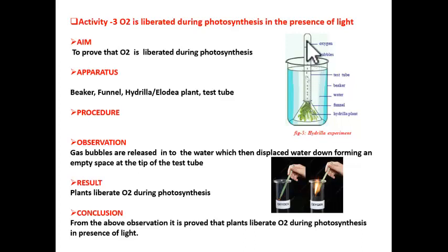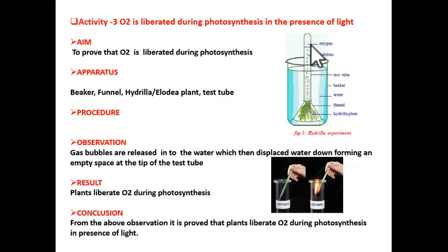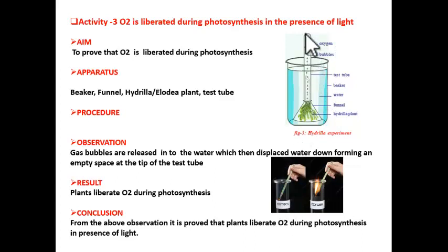As the bubbles rise up, they displace water downwards and get collected at the tip. Now we have to check what gas it is. For that, carefully lift the test tube by closing the mouth with your thumb and upright it. The gas which is collected at the bottom then comes to the tip.